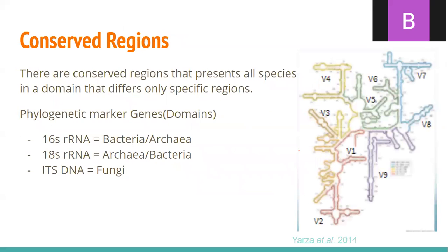In the genome of the species in a domain, there are conserved regions. These regions are present in every species in that domain.